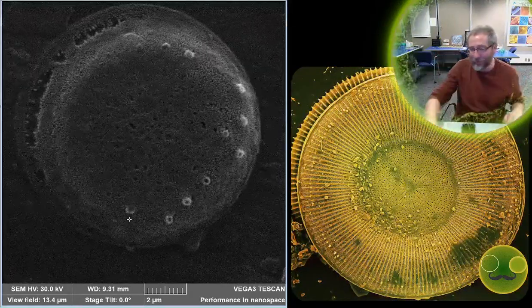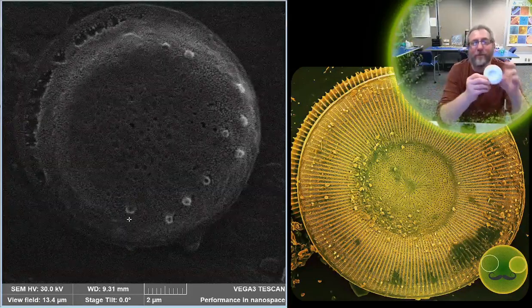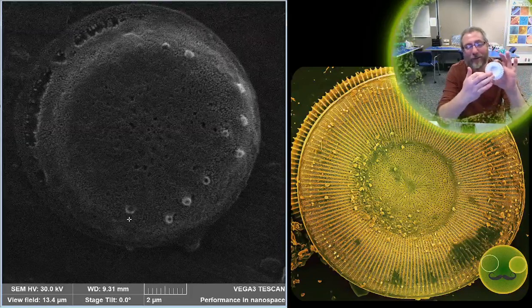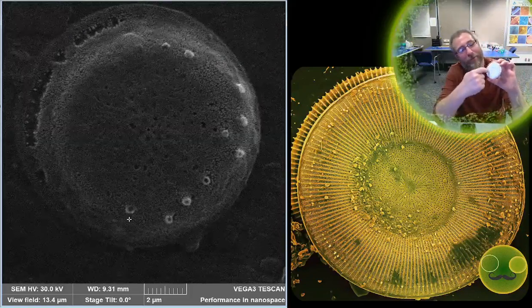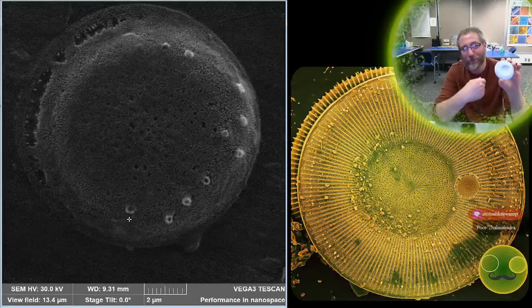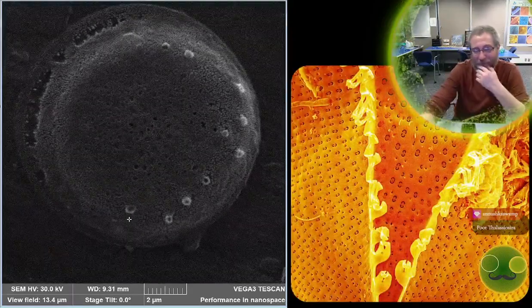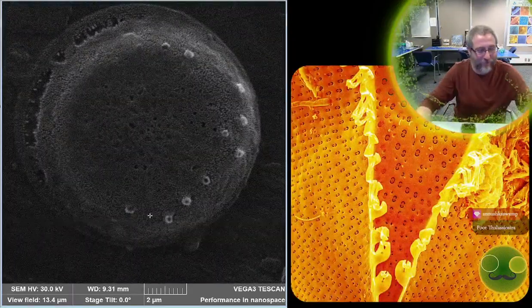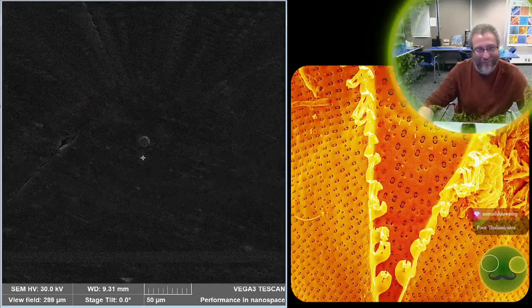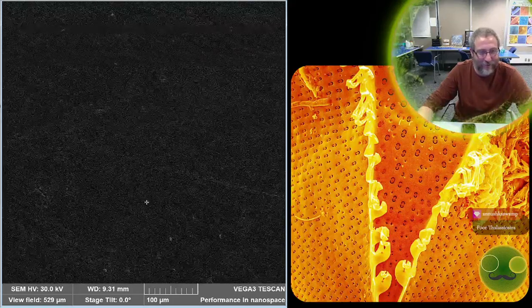So normally, if we think of these spines as being the position for where those things might normally be, it's putting its spines in this position, across the valve face, in totally the wrong spots. It's completely misshapen. This one was having a hard time putting its skeleton together the way that it was supposed to. And I don't think we want to take a picture of Quasimodo here.